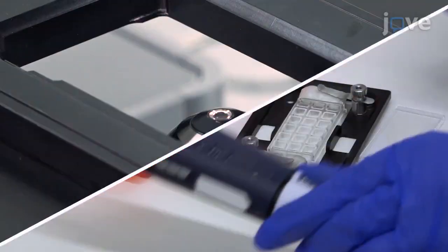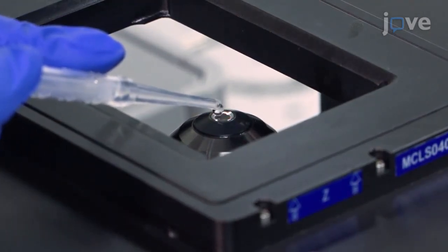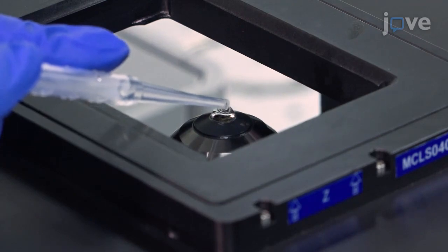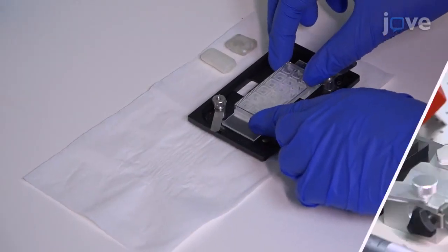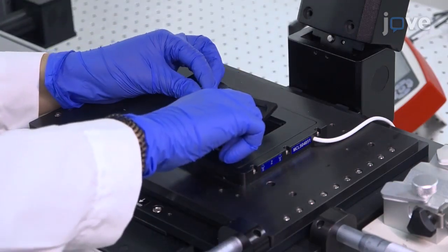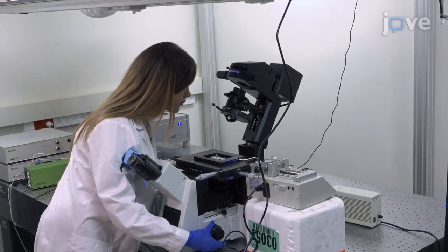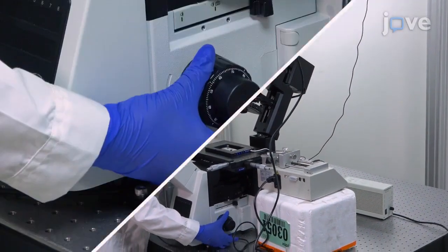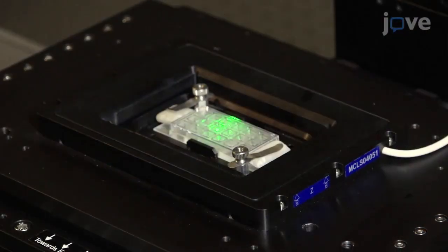Next, for the data acquisition, add a drop of ultra-pure water on the top of the high numerical aperture water immersion objective lens. Fix the cover slip slide in a stage chamber, and then install the assembly on the top of the microscope stage. Bring the objective lens upwards until the water droplet on top of the objective lens smears at the bottom of the cover slip slide, and open the laser shutter.